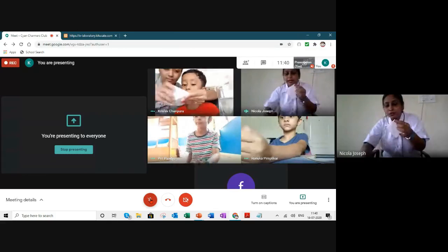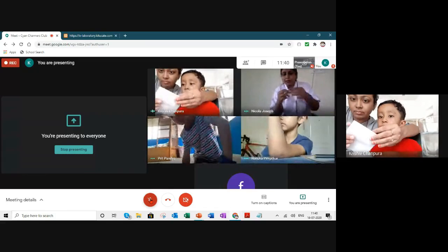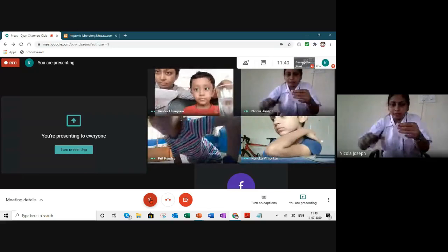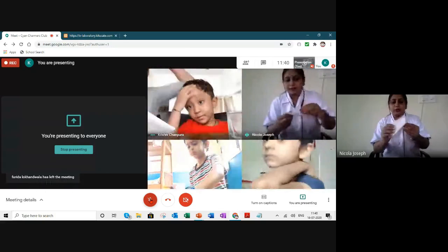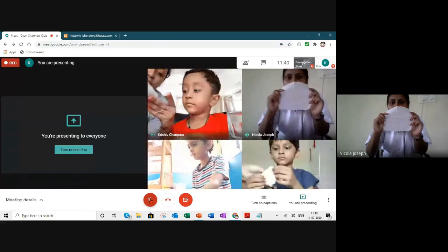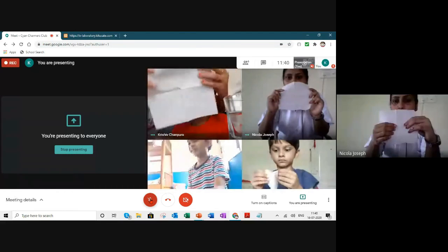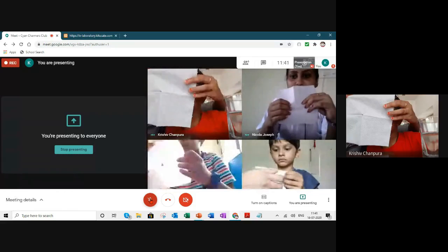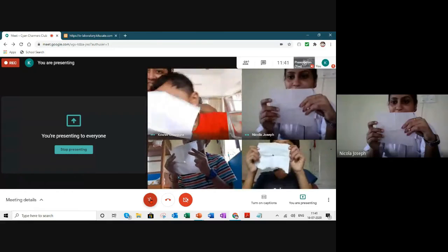Now this corner, you have seen one place of the corner, it cannot open, okay? That corner, what you'll do, you'll cut it, a little bit. I have done it, ma'am. Okay, now see, one small hole has come in your tissue paper at the center. You cannot see it maybe, but everyone will have a small hole at the center. Open, yes, very good, Krisha. Swaraj, see, open, yes.